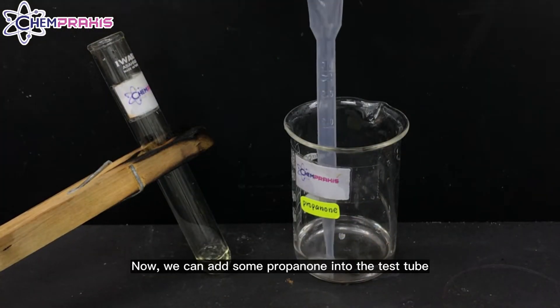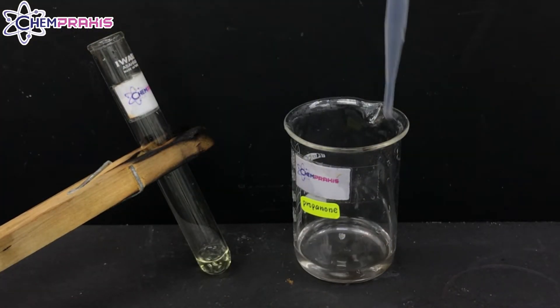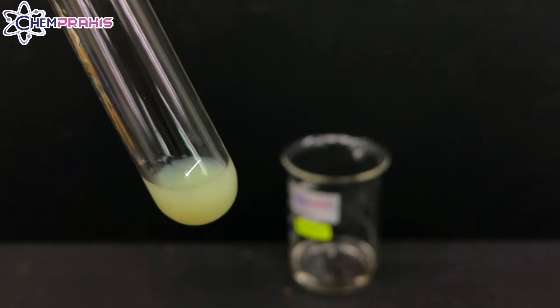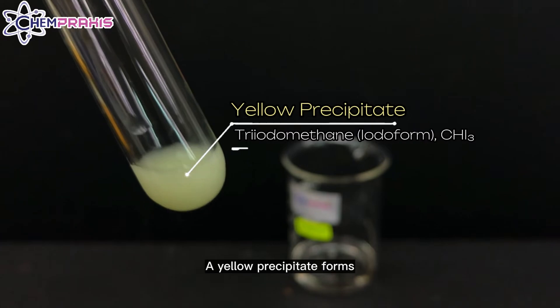Now we can add some propanone into the test tube. A yellow precipitate forms.